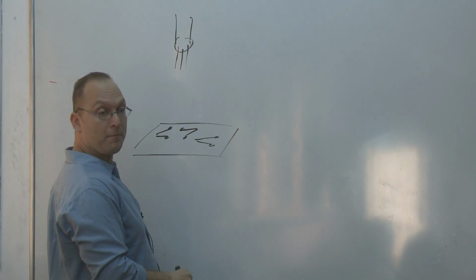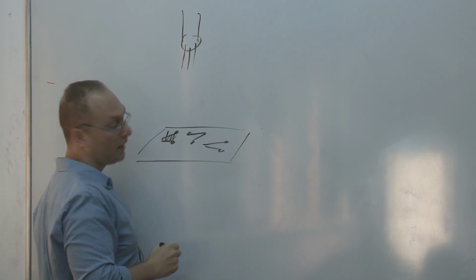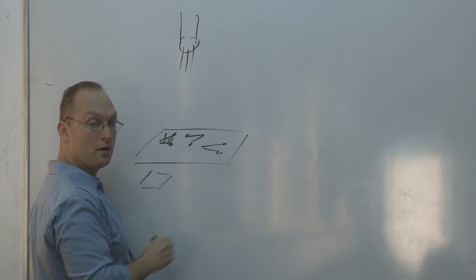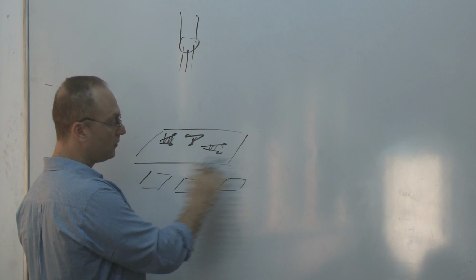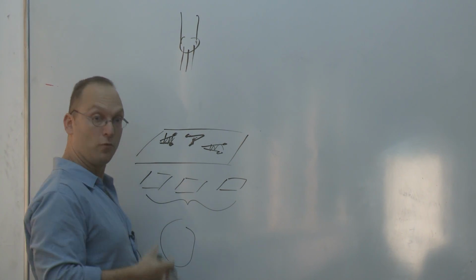Now the beam interacts separately with each of these molecules, and the molecule is destroyed as a result of the interaction, by the way, because the organic material is very sensitive, and you pick up a projection image which encodes the diffraction pattern. So in this way you end up with a collection of images, each associated with a different molecule in the solution, and the goal is to take this collection of images and to reconstruct from them the three-dimensional structure of the basic molecule.